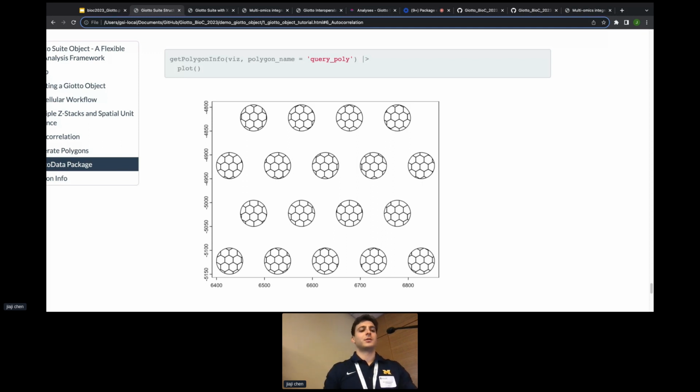So is the question, would you want to stay in Python or would you want to stay in R, and is a bridge between the two required? I'm a little confused by the question. I apologize. I'm trying to see how much of a dependency does this have. Oh, how many dependencies does Giotto have? Yes, because I'm going to import everything into one or the other. Requirements. How much do we have regarding functionality?